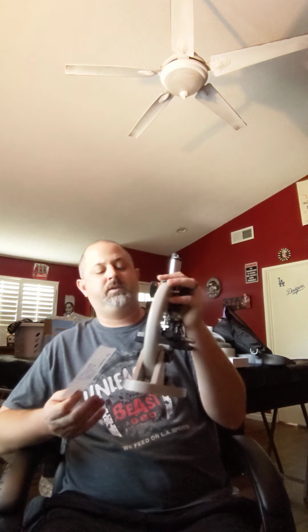Exercise 1 was components of the microscope. So here's the microscope that I used. They wanted to do an objective of using the low lens, the medium lens, the high lens, and the oil immersion lens. They also wanted us to determine the total magnification, and that is by getting your ocular magnification, times it by the objective magnification, and you get the total magnification.